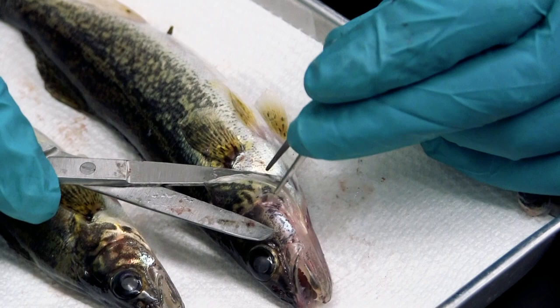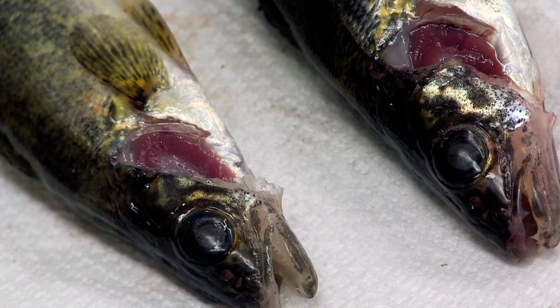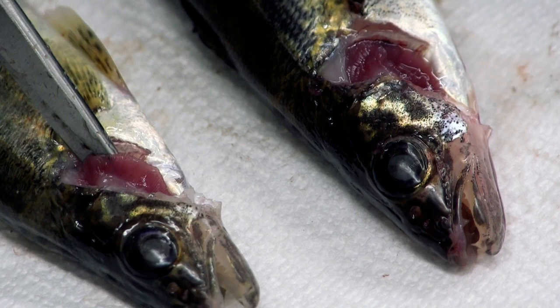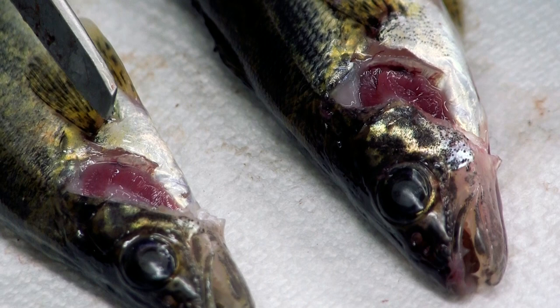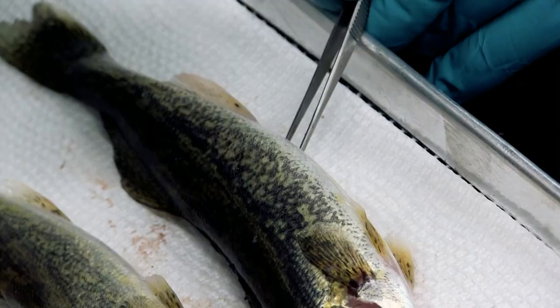Next, grab the operculum and lift it up, then clip it off — that exposes the gill. The smaller one has slightly paler gills but it's uniform. I'm not seeing any dark spots, light spots, raised lesions, or nodules. These gills look good in terms of conformation and shape; the lighter color is probably more a function of post-mortem changes. Now I'll proceed to open up the coelomic cavity on the next specimen.